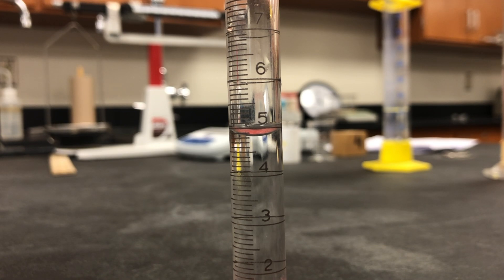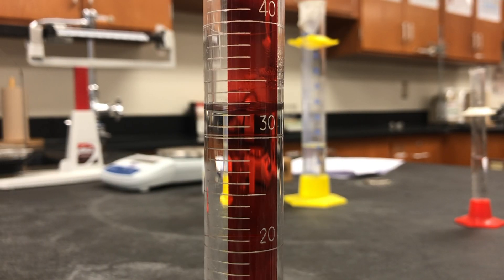Welcome to this episode of So You Miss Lab where we make everything up. Today's lab is the Lab Skills Lab part two.